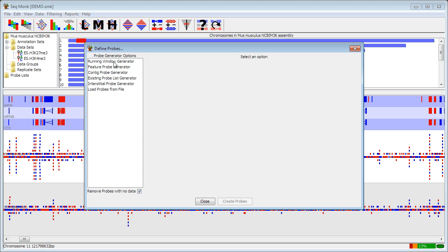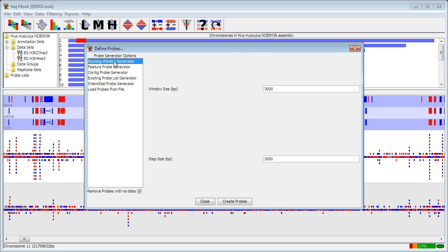There are a number of different ways that you can choose to make probes in here. You can select the different probe generator that you want on the left, and the options for it come up on the right. The simplest one is a running window generator where you just pick fixed size windows with a specific interval between them, and they're put completely across your genome.